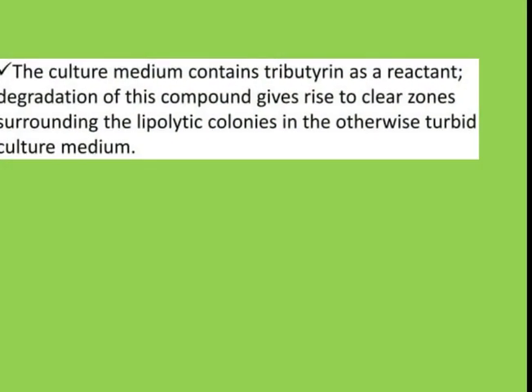The medium used for this experiment is a medium with tributyrin. It is a substrate on which lipase acts. After degradation of this compound, the medium gives clear zones around the growth of lipolytic bacteria. Otherwise, if the organism does not have lipase producing ability, the medium appears intact.